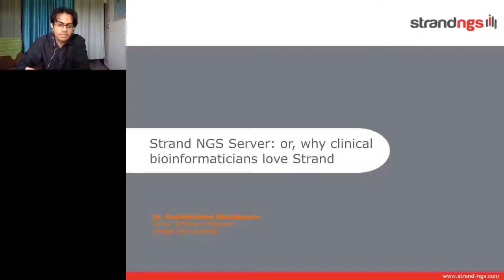This presentation is about Strand NGS Server, and I'm going to be talking to you about why clinical bioinformaticians, especially people who do clinical genomics, love Strand so much.